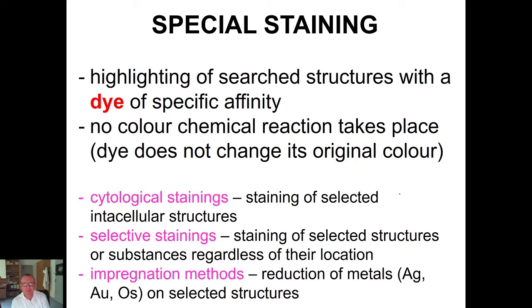The principle is to highlight some structure, so the dye which is used here has to have some specific affinity. And what is very important, during the staining there isn't any color chemical reaction.